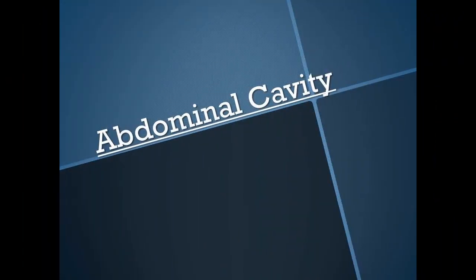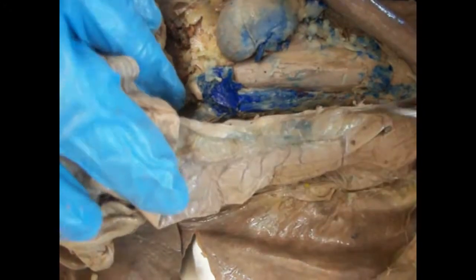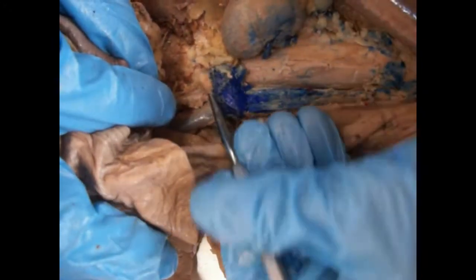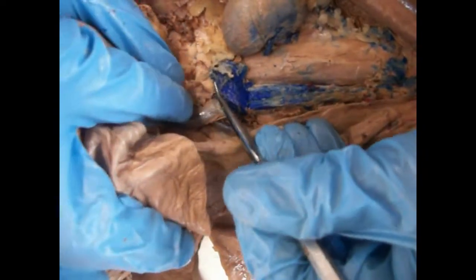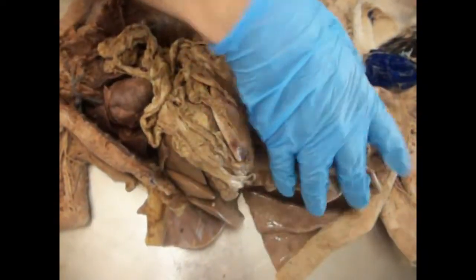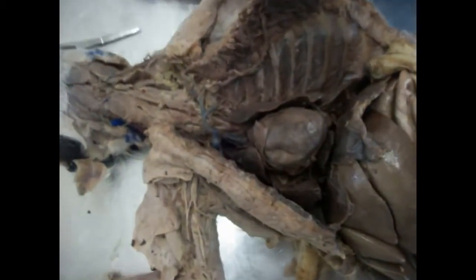Now as we head down to the abdominal cavity, you will see a very large blue vein. This is known as the inferior vena cava. And lateral to this vein, there is the abdominal aorta. However, it's not very prominent in our cat due to the large amount of latex. Now, the inferior vena cava travels through the diaphragm and connects to the right atrium of the heart, where the blood flow will continue through the lungs and become oxygenated once again to be sent throughout the body.